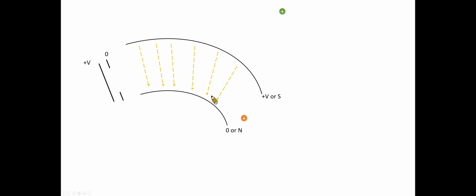Let's think about all the forces at play here. First, we have a kinetic energy, 1/2 mv squared, that's related to the initial accelerating plate, the V over here. Because the charged ion is moving in the electric or magnetic field, we are going to have a force pushing down on it.